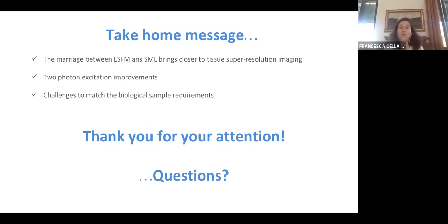We also saw how two photon excitation can participate and bring improvements in this scenario. And also how important it is to think about matching the biological sample requirements and the optical technique, because if we think about all these aspects, we can really reach high quality imaging in tissues. So I would like to thank you for your attention, and I will be happy to take questions.